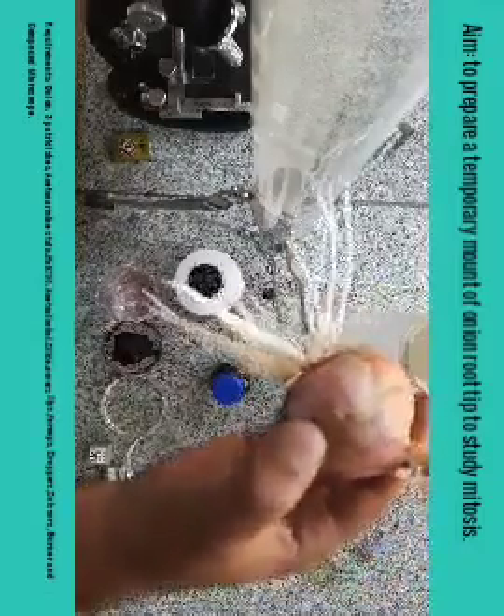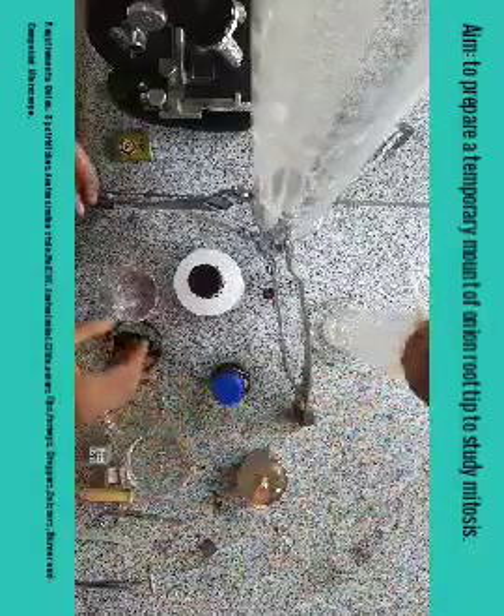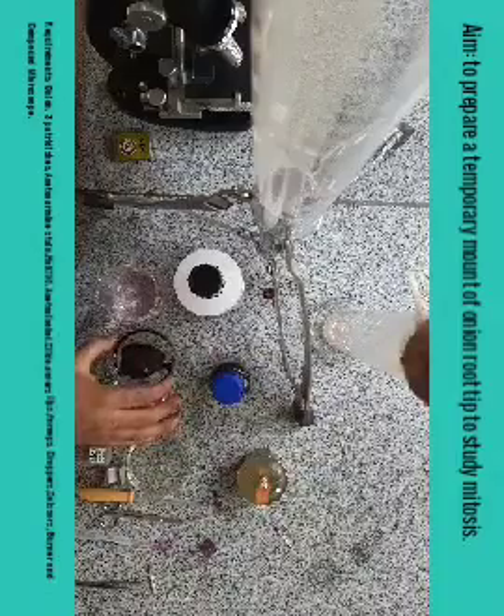Let us see first of all what materials we require to perform this practical. First, we need an onion with freshly grown root tips, like this onion. I have kept this onion in water for six days — freshly grown roots are there, you can see. Second, we need three petri dishes. In one petri dish I have put the carmine stain, which is used for staining and providing color to the chromosomes.